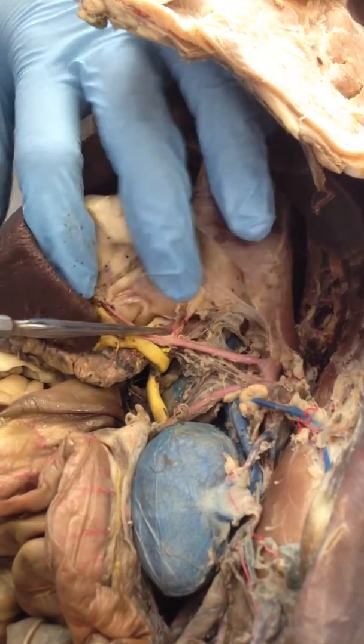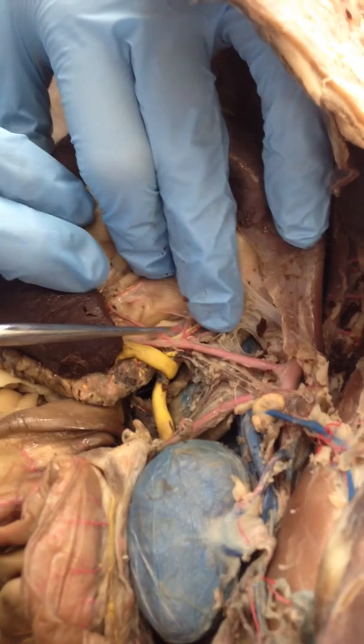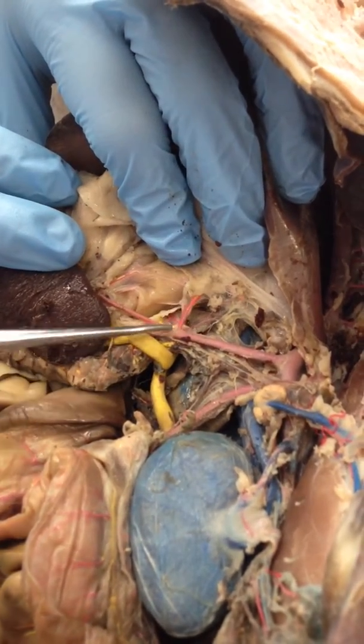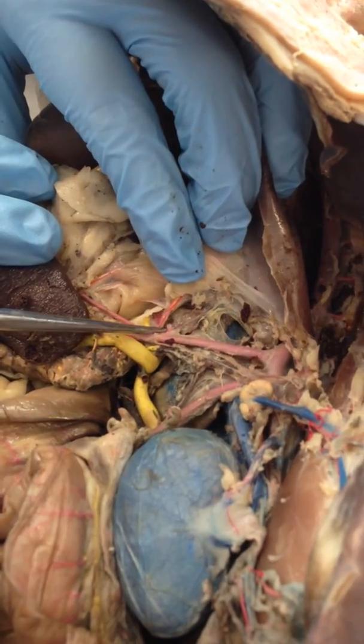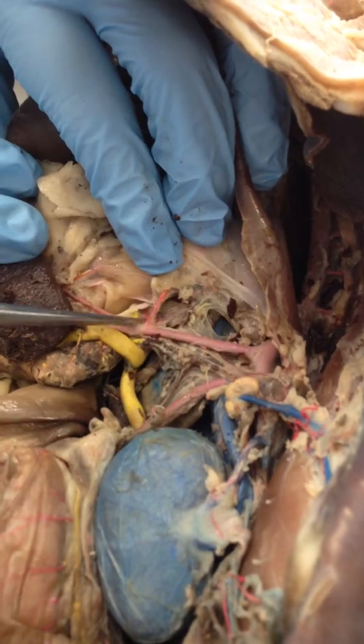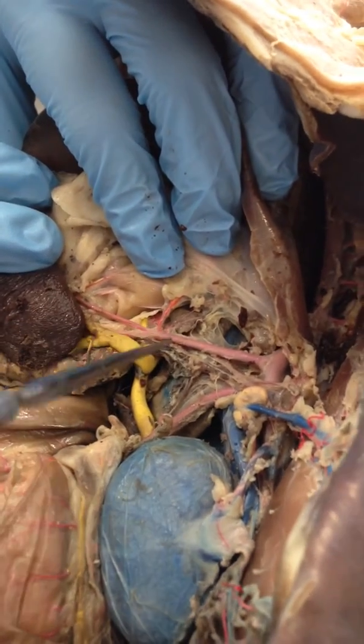That's the hepatic, down there, because these are going to the stomach. Okay, so are those gastric? Yes. And so the hepatic actually comes in lower. You can see it's lower down. It's the first branch off the celiac. If you look, it's going to be about right here.